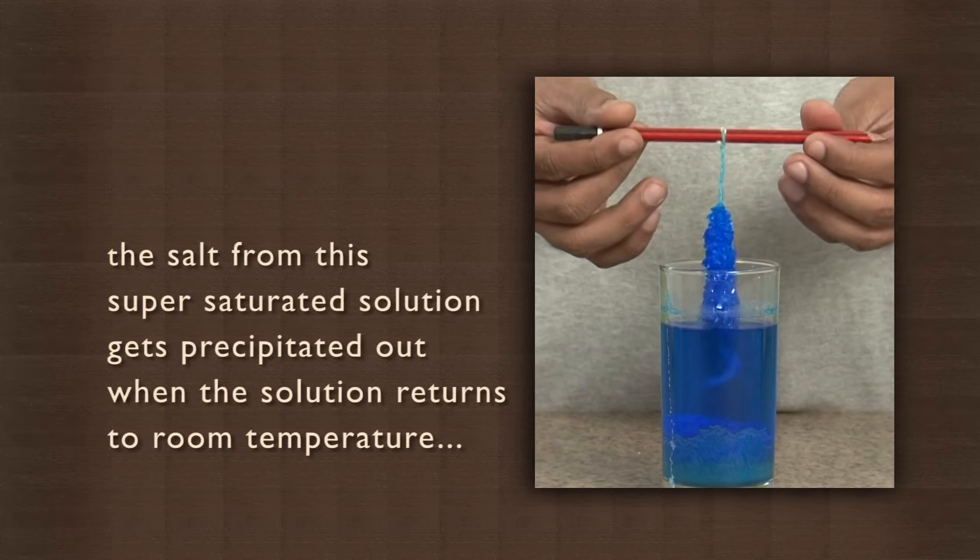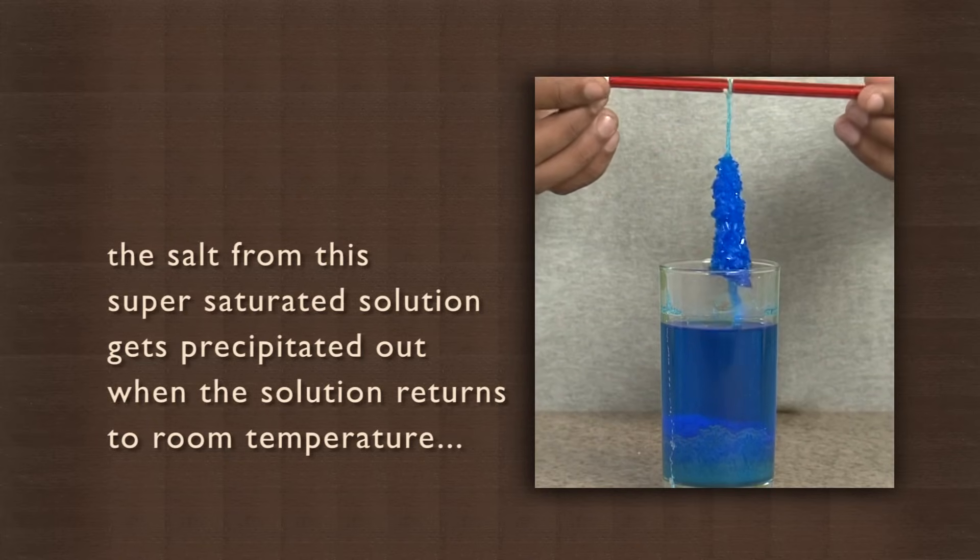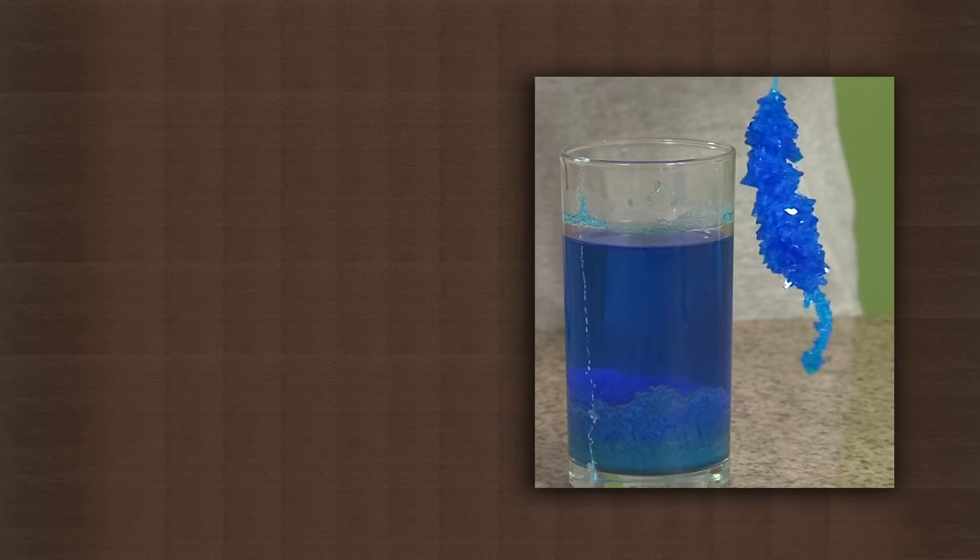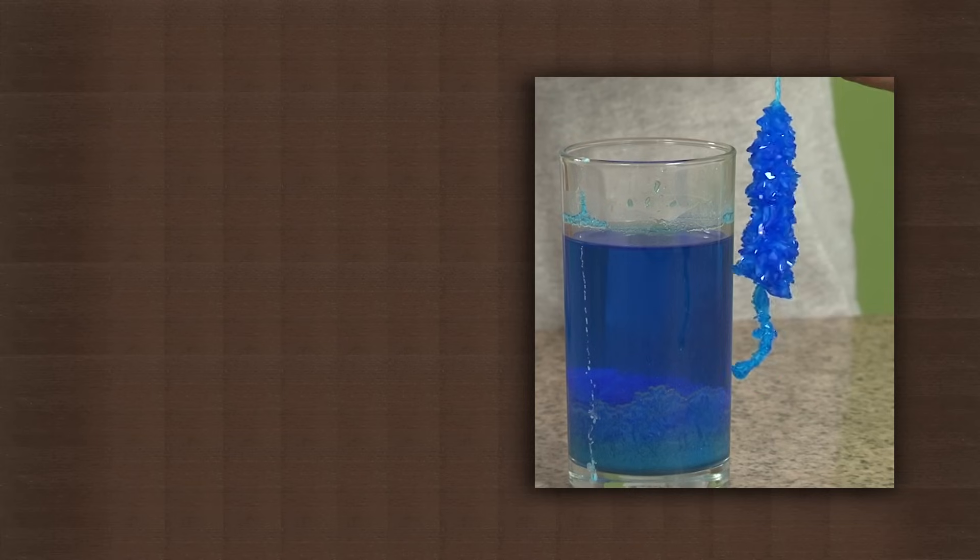The salt from this super saturated solution gets precipitated out when the solution returns to room temperature. The salt molecules that get precipitated out start forming crystals at the nucleation centre, which is the thread in this case.